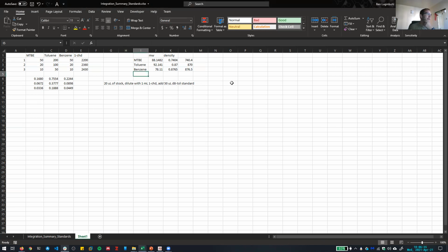So let's add some stuff to our table here. Let's do D8 toluene as well. Can someone look up the molecular weight? I'm going to assume that the density is the same as toluene. That might be wrong though.